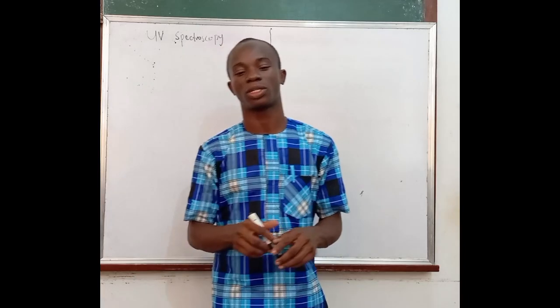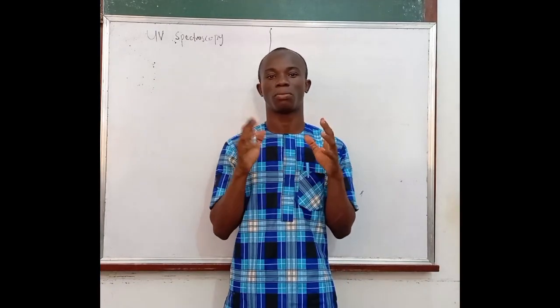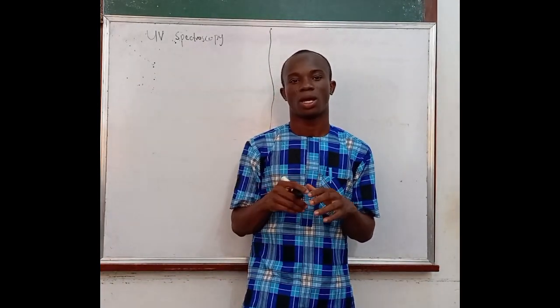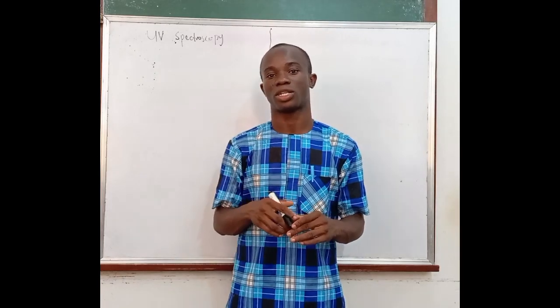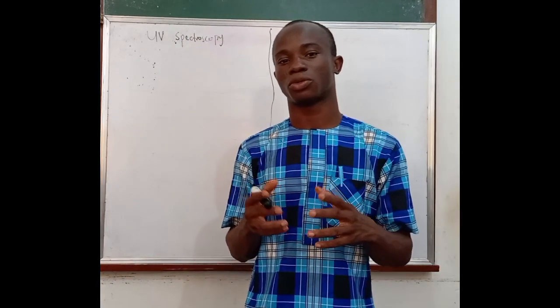So we are going to be talking about which regions of the electromagnetic spectrum we are considering. We're also going to be looking at some of the things that characterize UV spectroscopy. At the same time, maybe do an intro into electronic transitions. Now, what is UV spectroscopy?